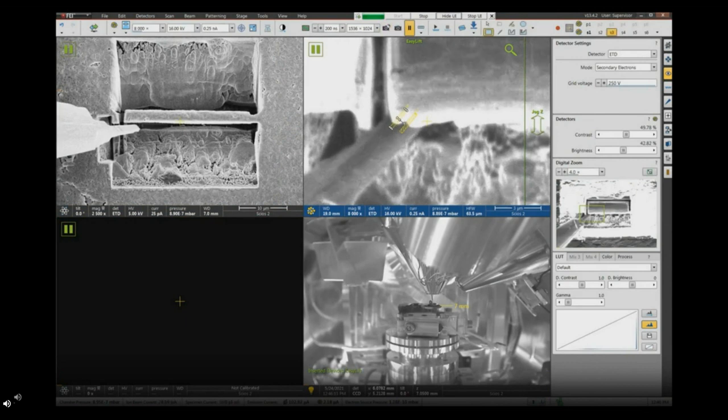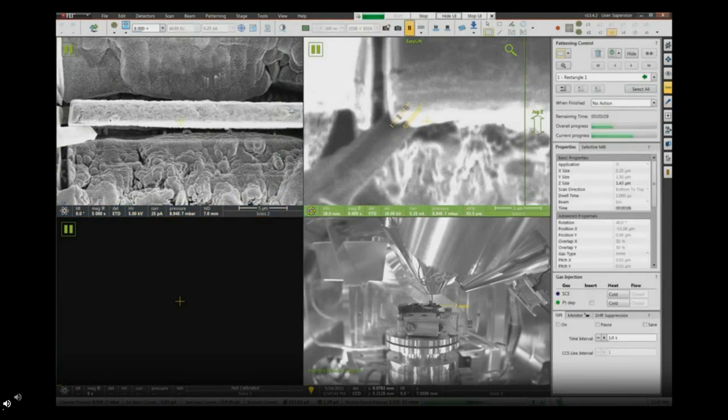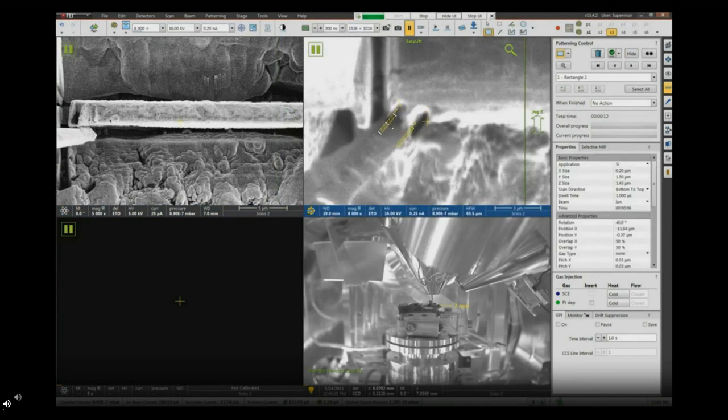So I'm putting my little patterns there. I'm going to bring the needle into contact. And this is sped up by 10x. I'm not that fast. So I'll let those two patterns move, and then I'll move them outwards, sequentially taking images of the connection with the E-beam, and doing a little bit of an extra pattern, and then there's my connection.